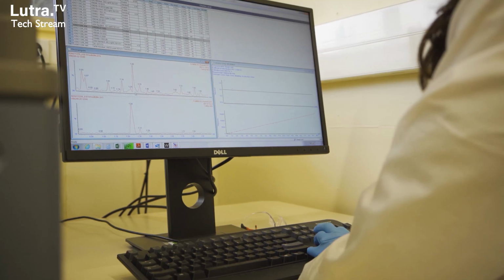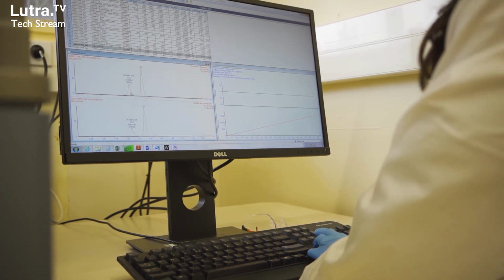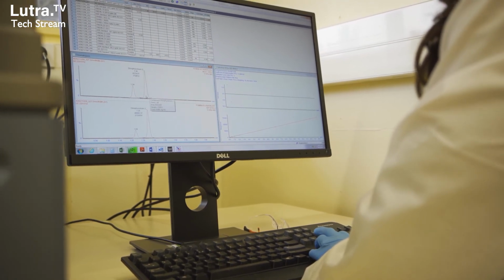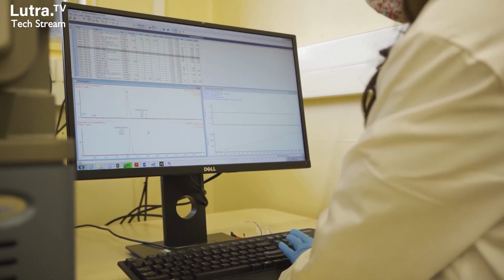The machines are calibrated with standards, which are purified versions of the toxins we're looking for, and comparing a wild sample to that allows us to know exactly how concentrated that wild sample is. That's the determinant of whether there are toxins in there or not. That's the real diagnostic, and that's used for regulations.